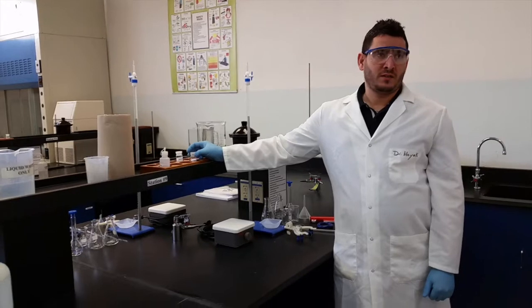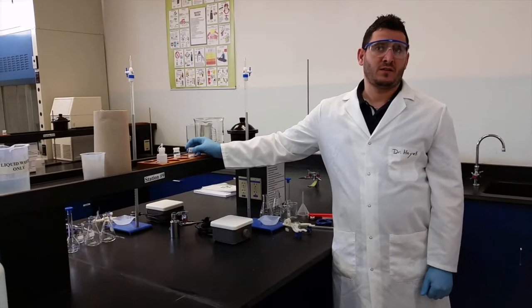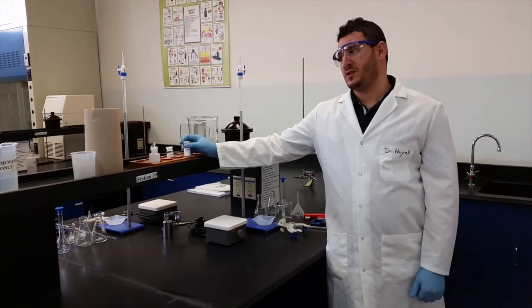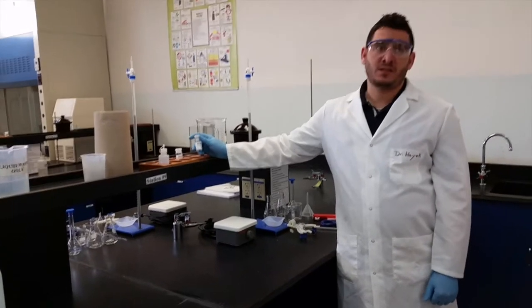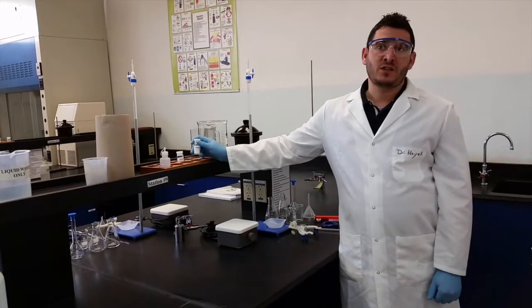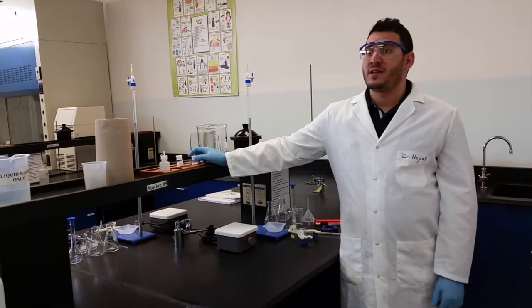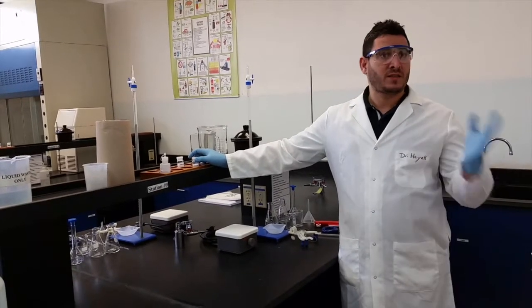We need to determine the formula of an acid salt through titration. What is an acid salt? An acid salt is a salt, so it's an ionic compound that's made from a metal.